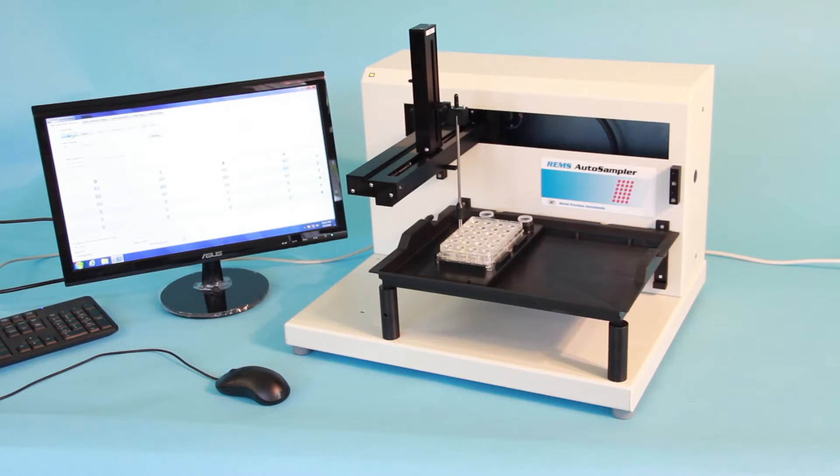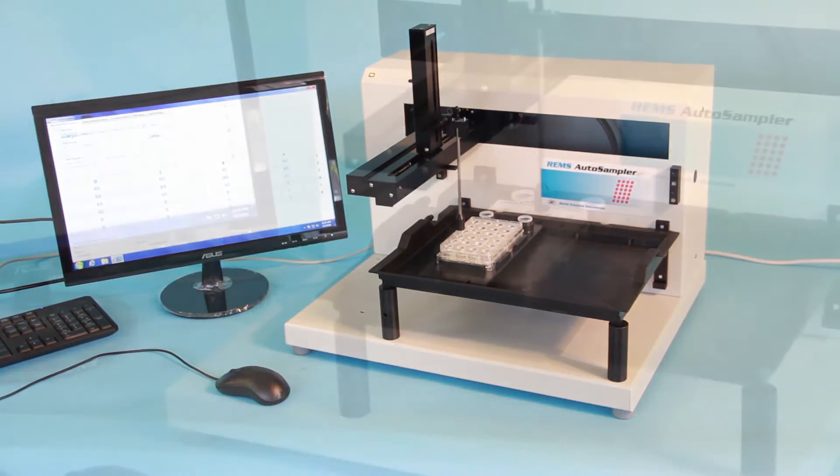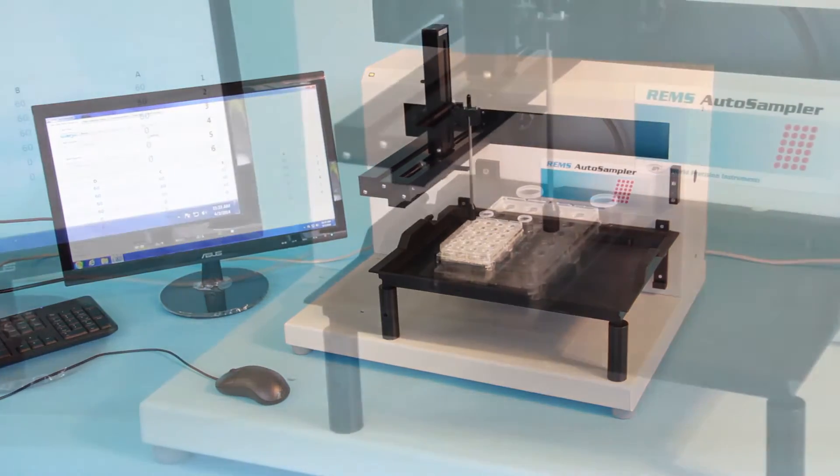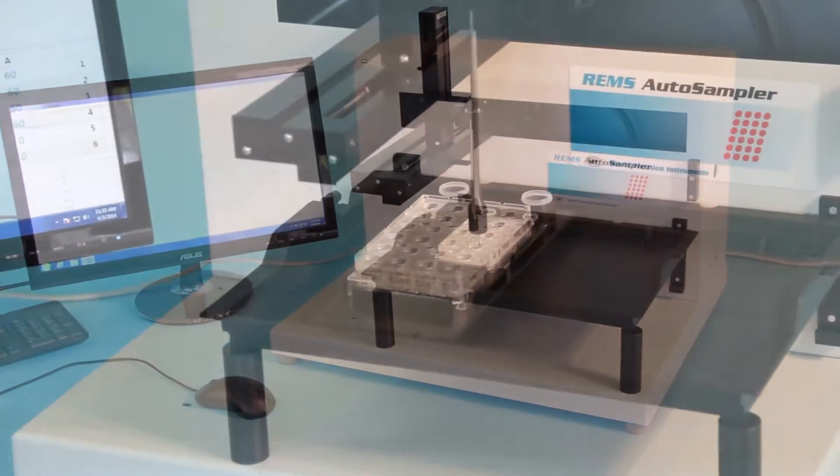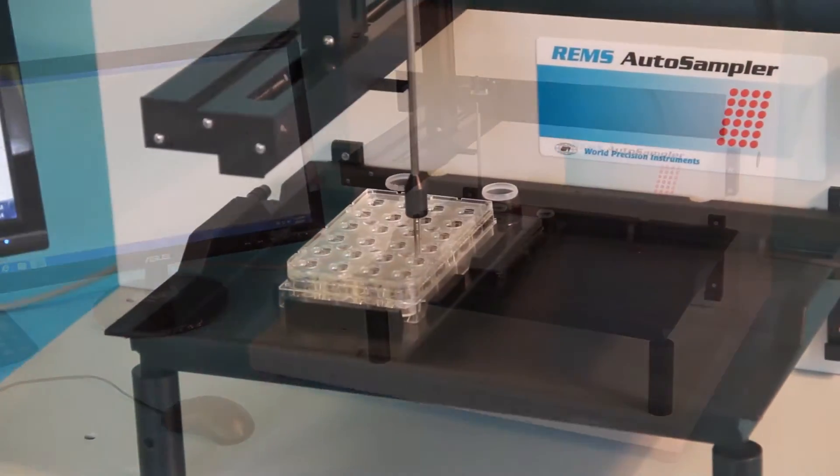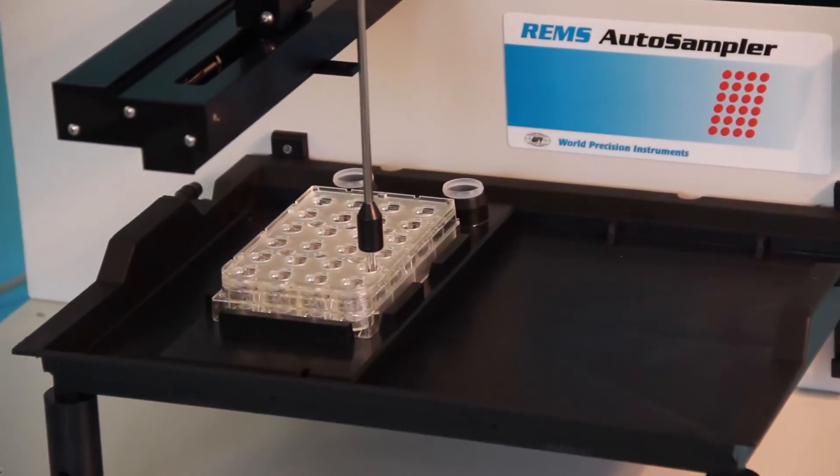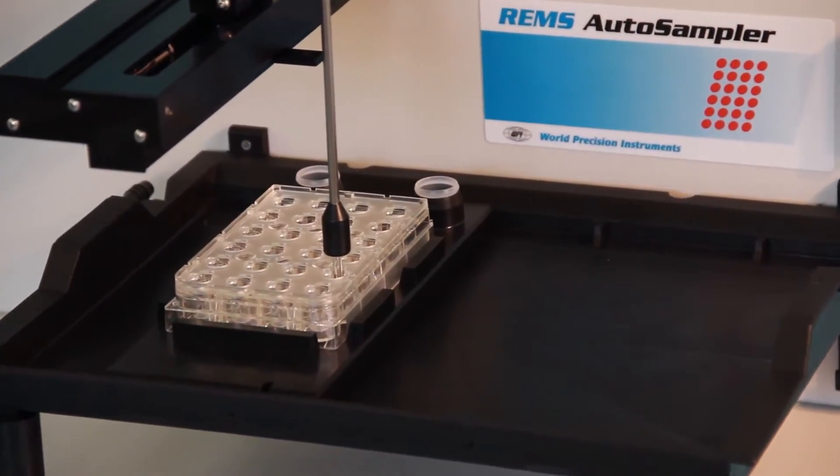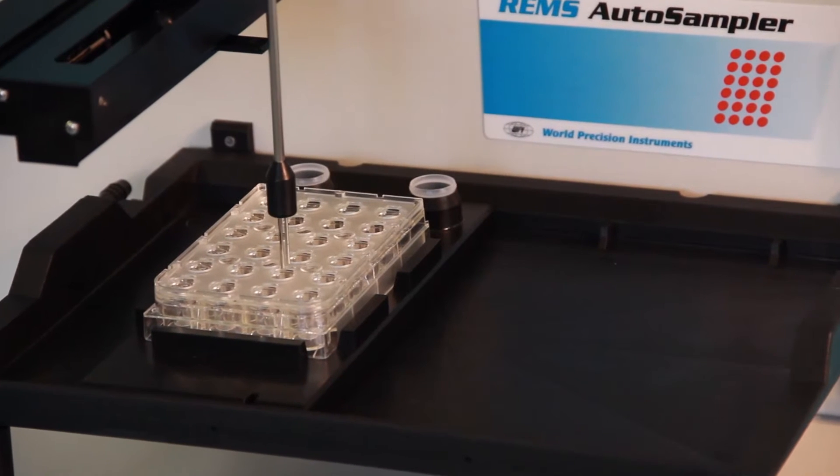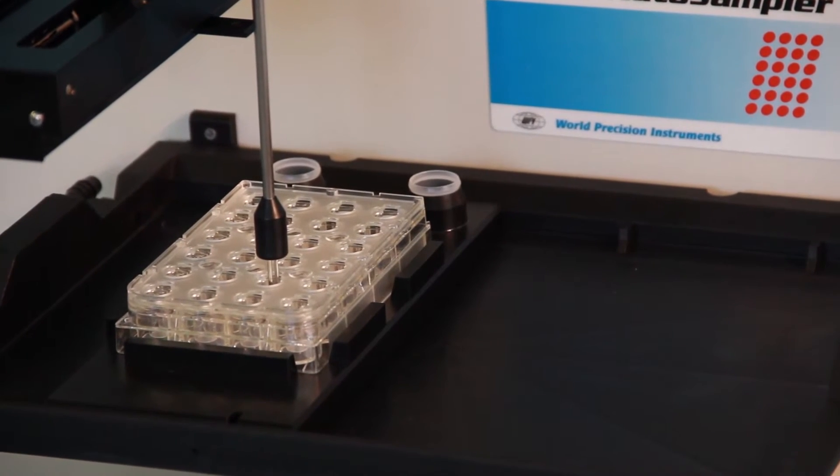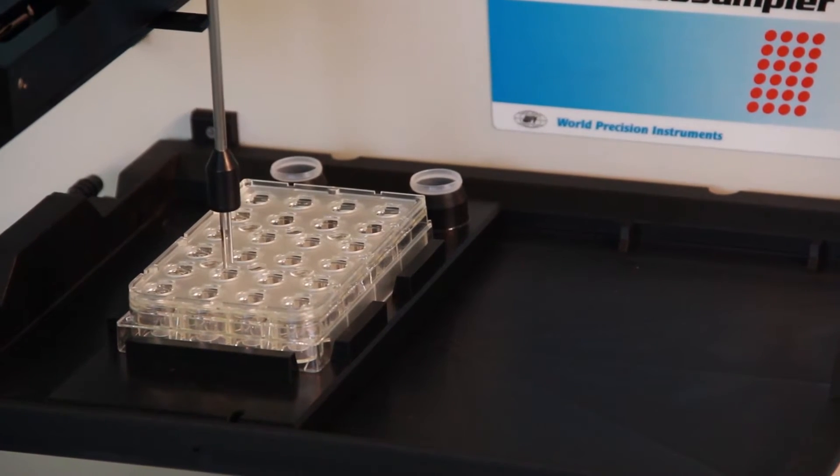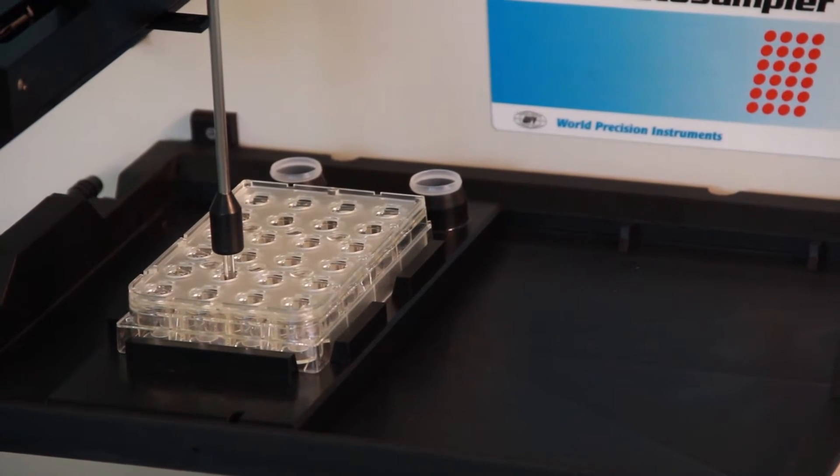If high-volume trans-epithelial electrical resistance measurements are part of your research protocol, WPI's REMS Automated TEER Measurement System can save your team valuable time and improve reliability of test results.